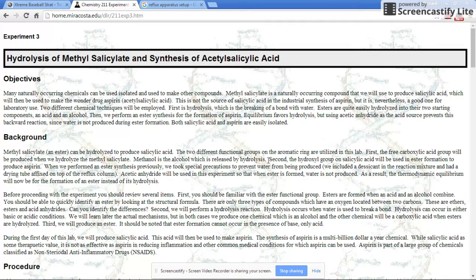So we will react. We will now do the new thing, which will be the refluxing for a half an hour. Then you'll return your material back into an insoluble substance, precipitate it, wash it on the filter, then recrystallize it, then get its melting point. So really, pretty simple experiment from that standpoint.